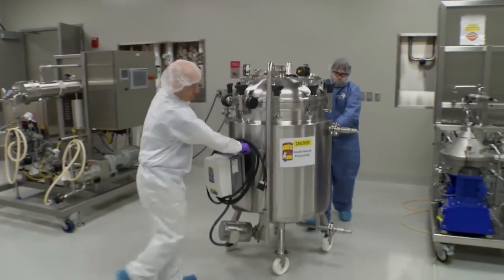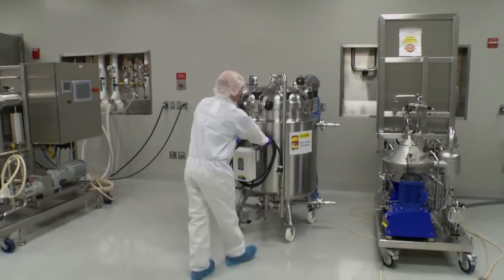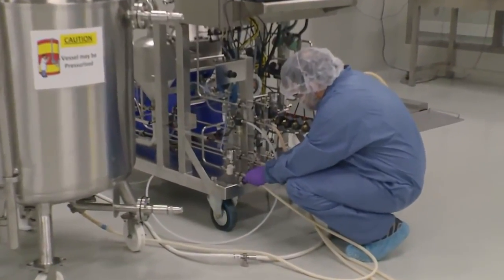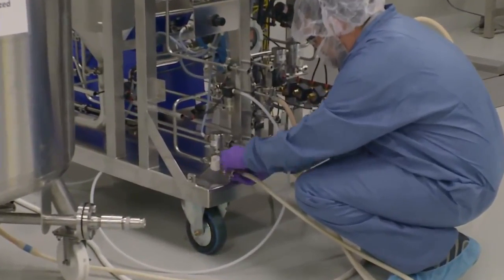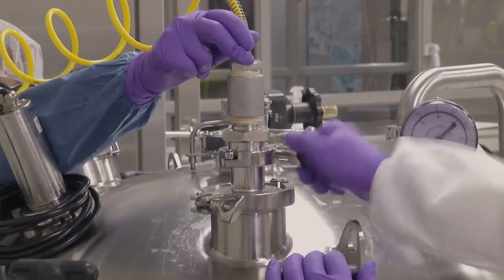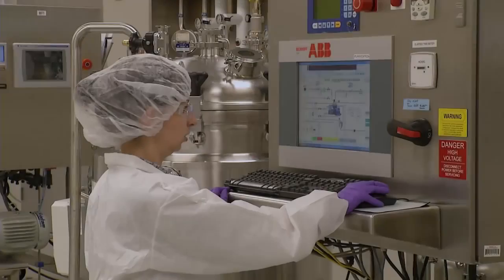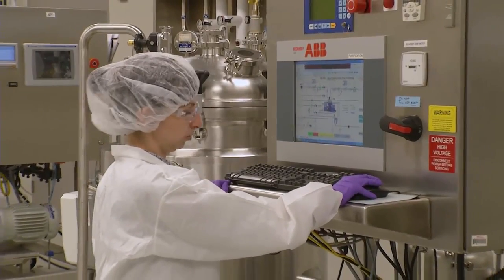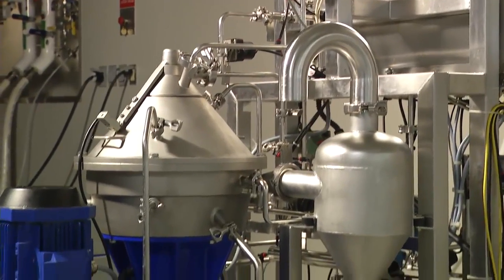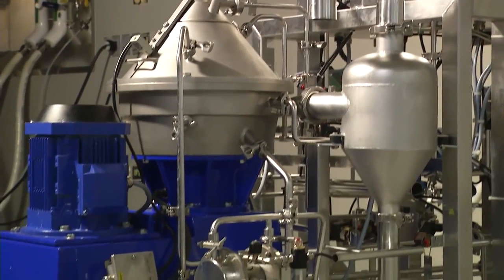GFP recovery begins with the arrival of the broth tank. A sterile hose is run from the broth tank to the disc-stacked centrifuge, and the tank is pressurized to drive the broth into the centrifuge. After the centrifuge has reached a stable running speed, the inlet valve is opened and broth enters the bowl.